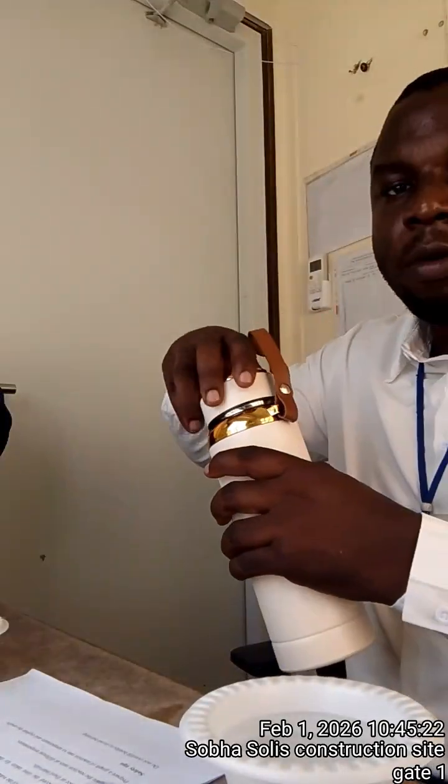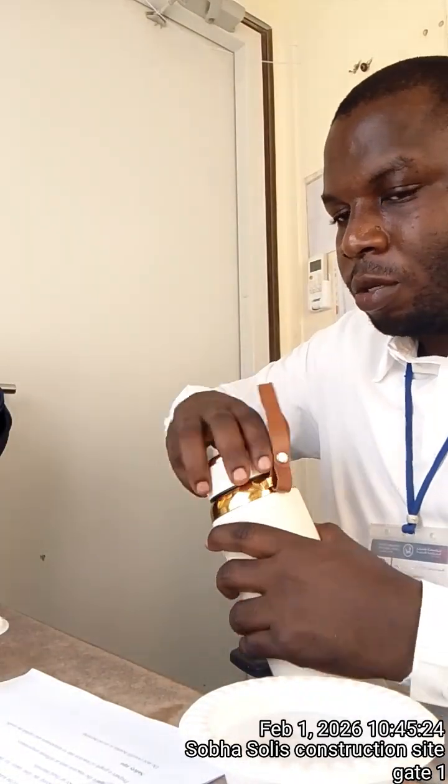Then we have another bath with normal water, at room temperature. This is not hot water. This is normal water. Next we are fetching water which is hot, moderately up to 40 degrees.